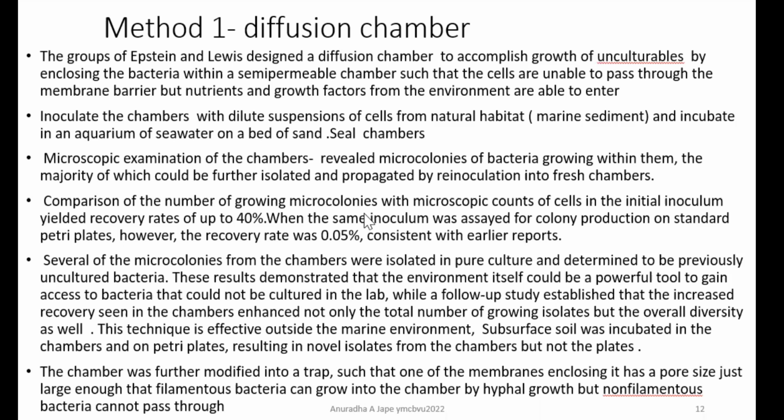So you can just leave that chamber and observe it under the microscope, or you can purify the colonies growing onto it, onto spatial media. But again, are they going to appear as actively as seen in the diffusion chamber? Are they going to be transferred efficiently, incubated, and grow into colonies?